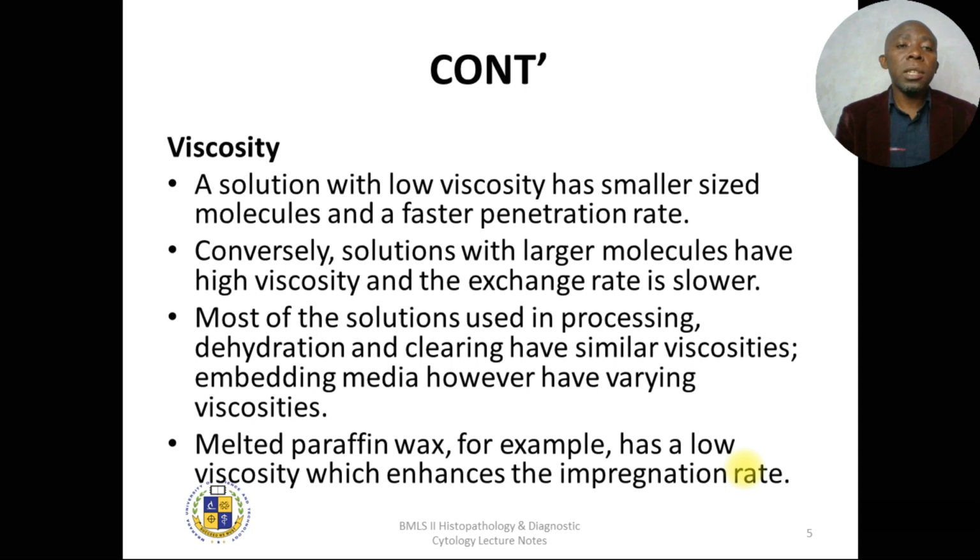Going through this very fast, take viscosity for example. A solution with low viscosity has small molecules, and these molecules move faster, which means a higher rate of penetration, and they can fix or infiltrate the tissue very well. Conversely, solutions with large molecules have high viscosity, and the exchange rate is slower.